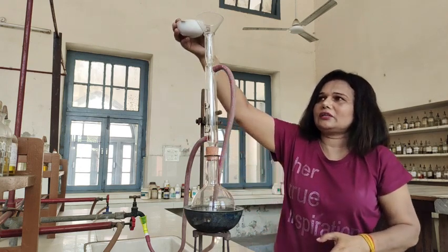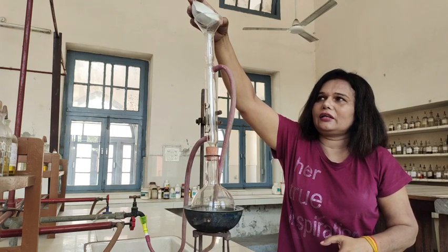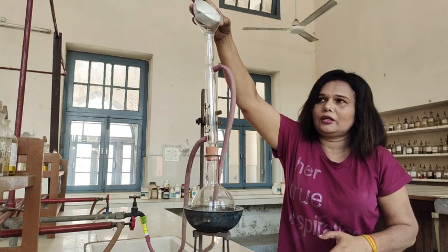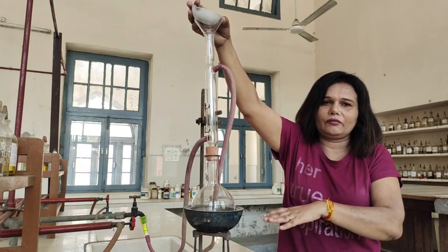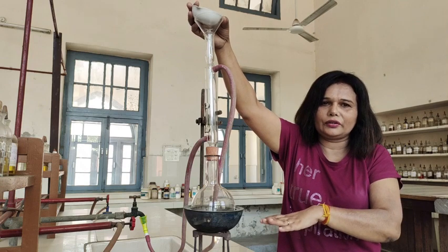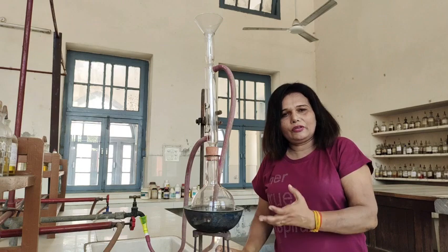Now we'll transfer this whole mixture through a funnel into this. We'll heat it for 10 to 15 minutes so that it is completely dissolved. Then after that we'll do the filtration, using fluted filter paper.